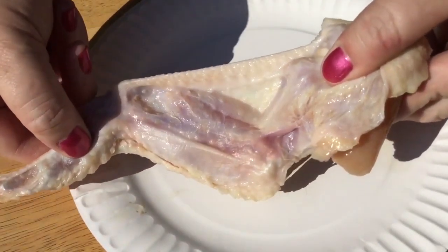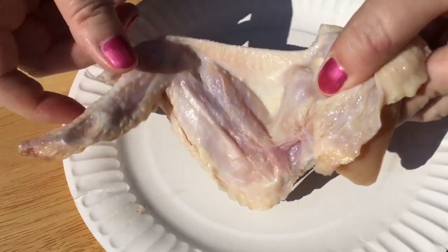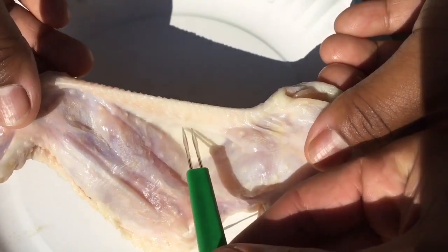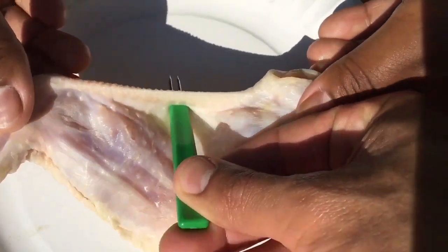You will be vaccinating your chickens in the portion of the wing called the wing web. It is the thin part located here. You can practice on a store-bought chicken wing, being sure to press all the way through the wing web.